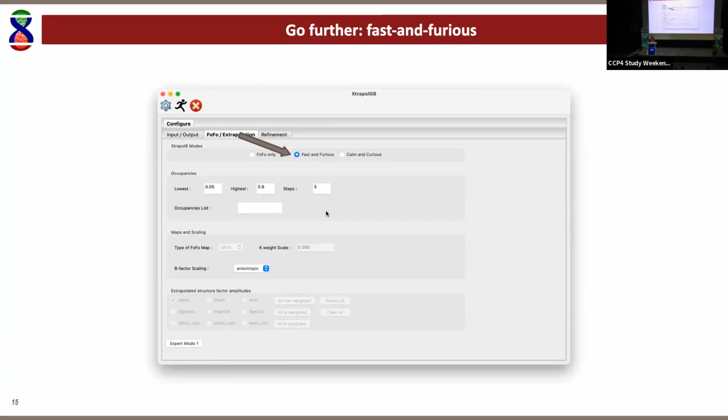Maybe one more question. James Holton asks, is your M the same M found in sigmaA, as in 2mFo-DFc maps? Oh, yes. So these are the standard figure of merit to calculate maps. And I'm happy to discuss further with James Holton if he has better ideas.